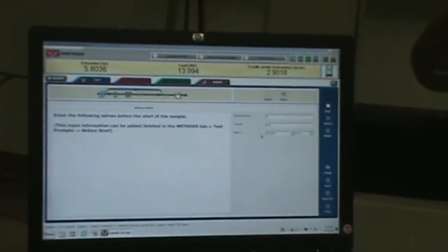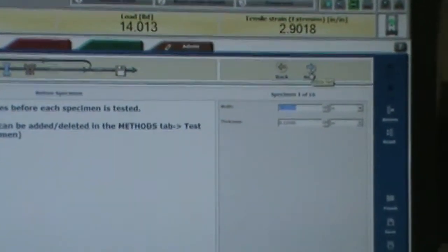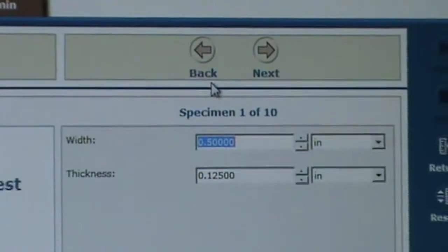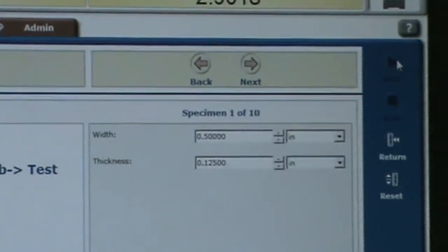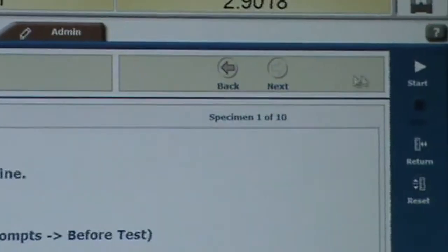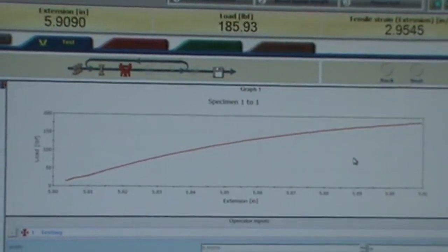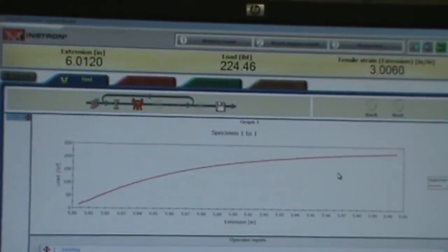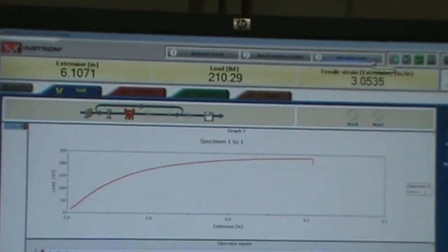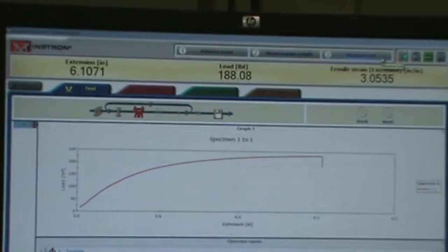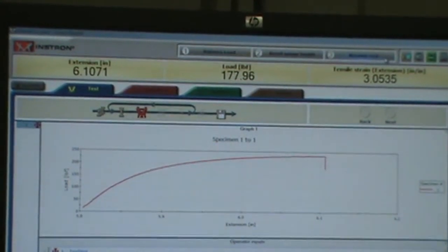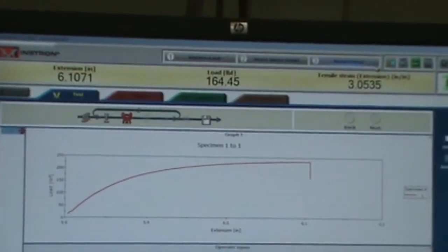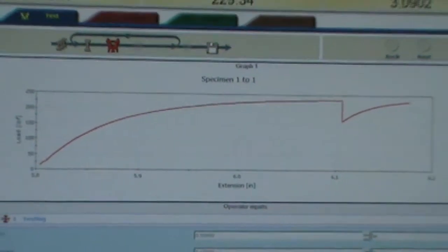So we're going to go ahead and run. There's 2 minutes right there. Again, the width and thickness. So we're going to go ahead and start. So it's running. So right now I'm going to say this is the maximum load. 70% of the maximum load. I'm pausing. Now I'm going to wait for 2 minutes. Let's say we went to 2 minutes. I'm going to resume now. And the resume is right there. So it's going to resume the test. Now it's going to go ahead and break your specimen.